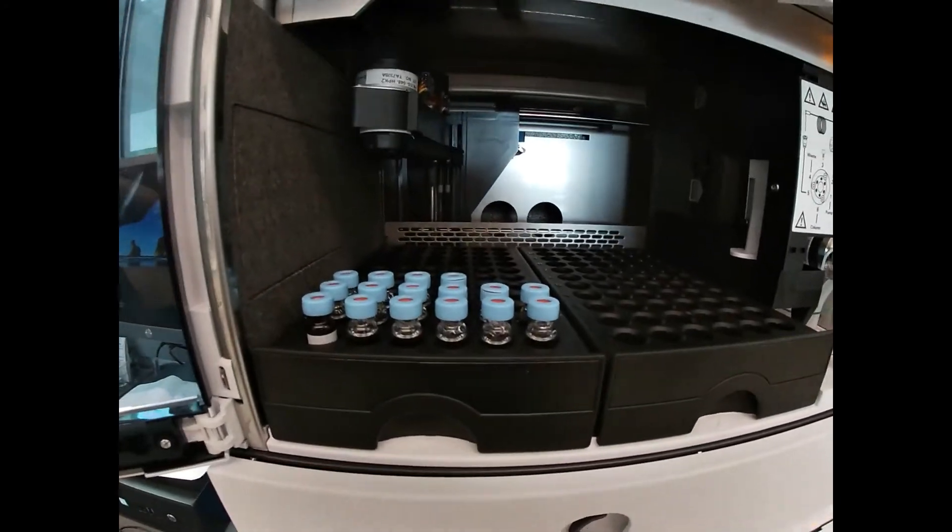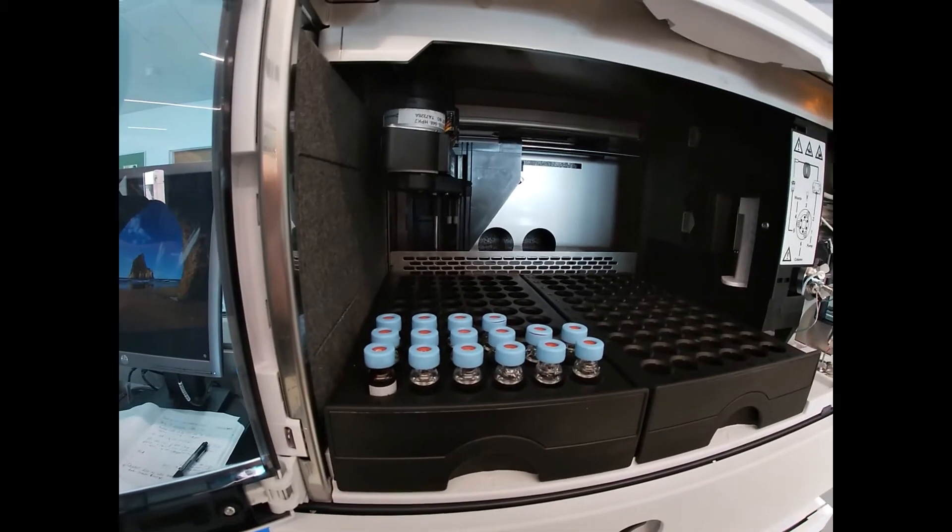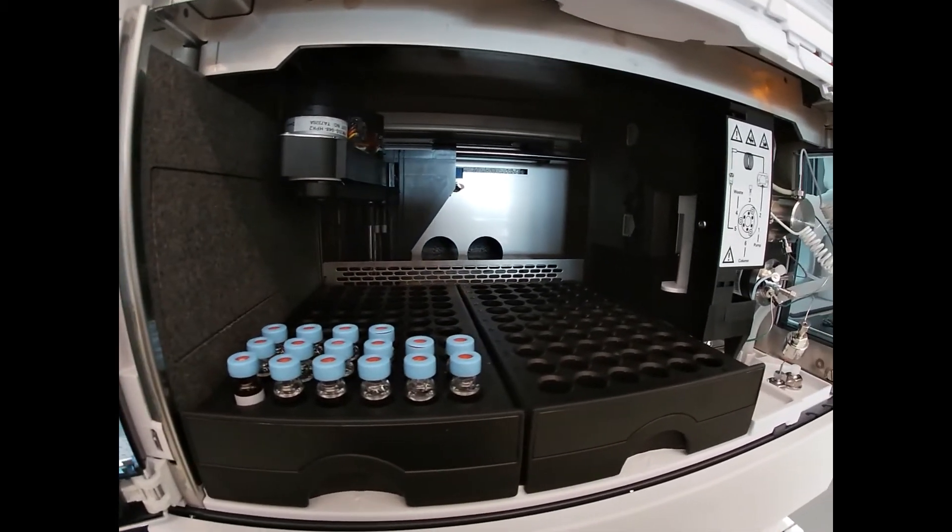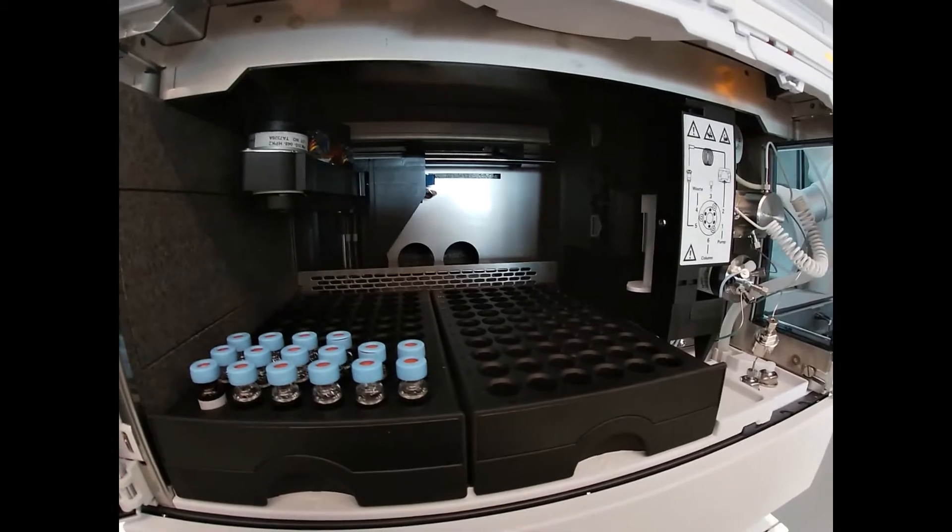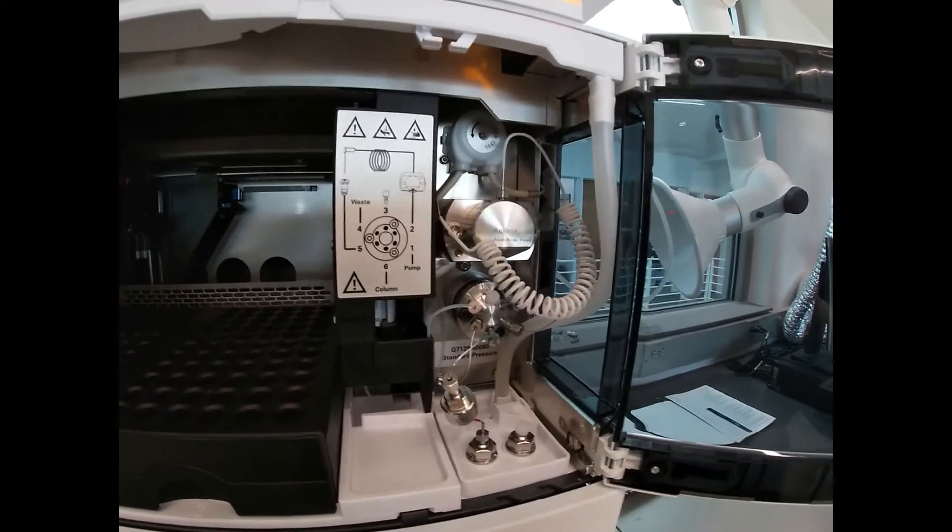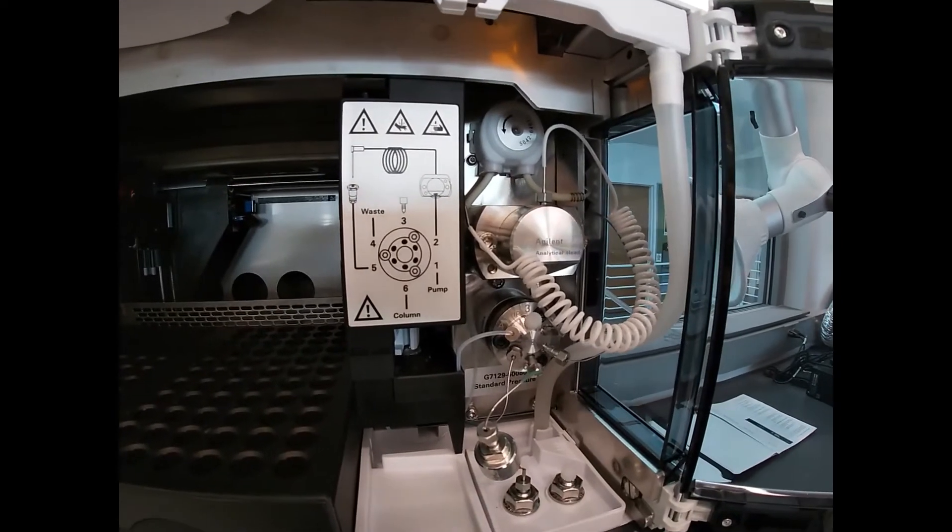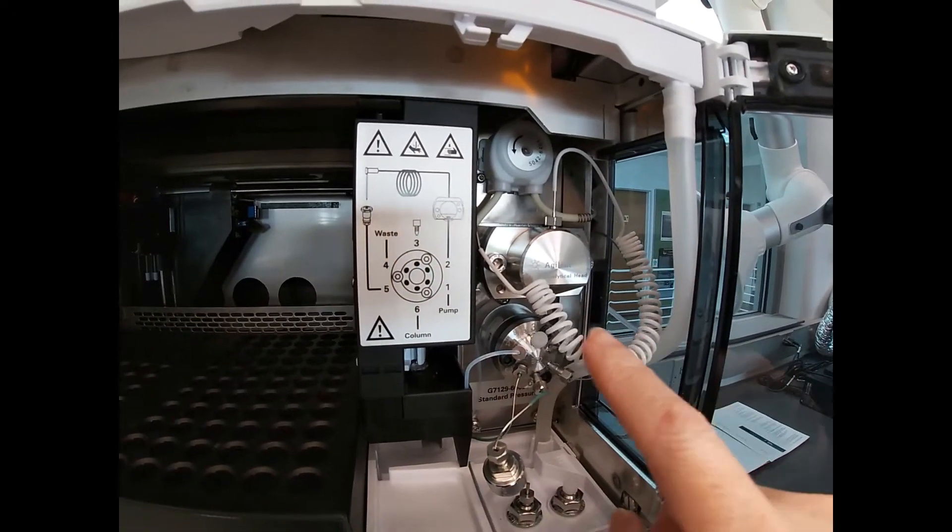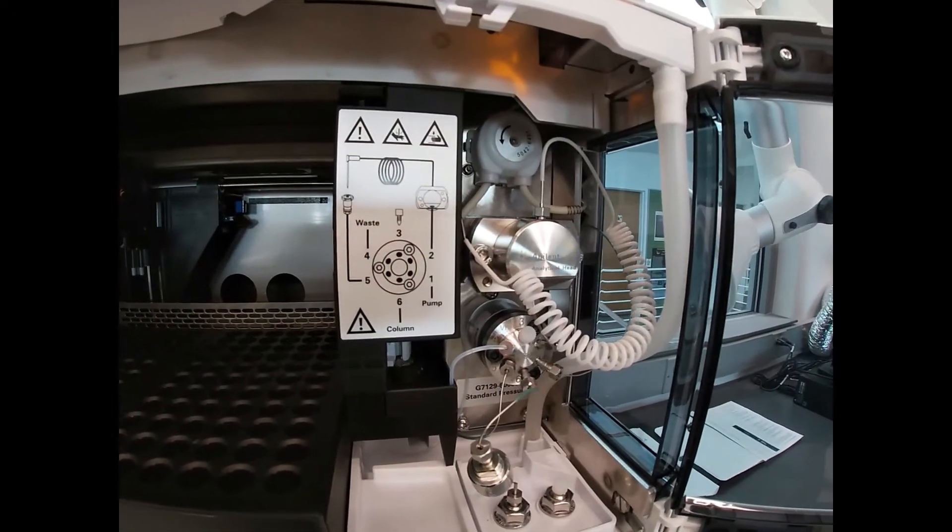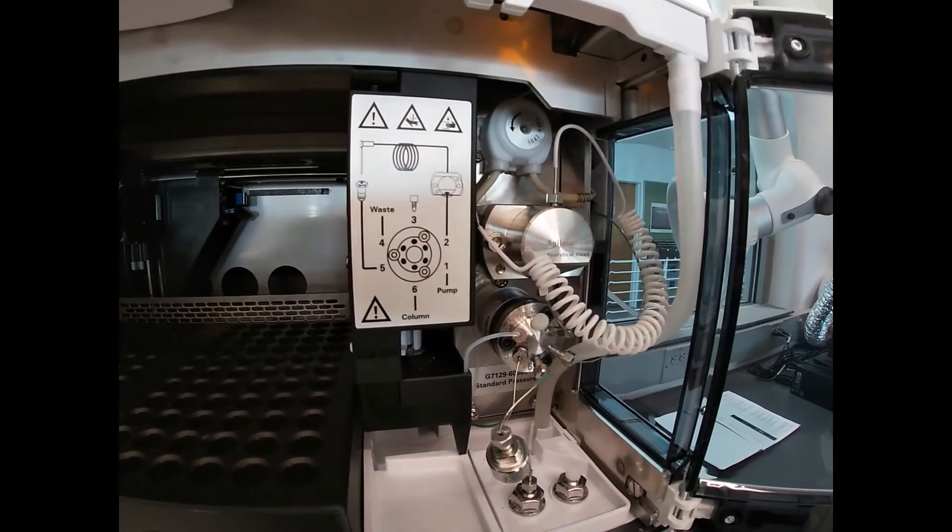We come up here and we can see our auto sampler area where we set up our samples. This is where the action happens as far as injecting. We have an injection loop here that we can fill based on what we dial in.